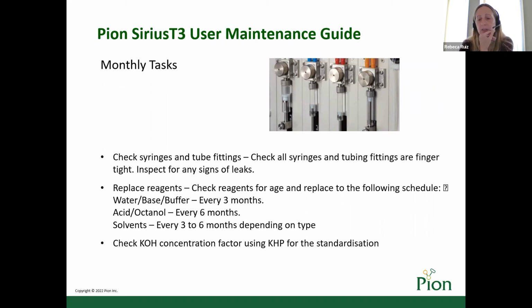you need to check syringes and tube fittings, and this means that with time the syringes and the fittings start to become loose. Then, because it's a monthly task, some reagents will need to be replaced. And the KOH concentration factor needs to be standardized with the KHP.